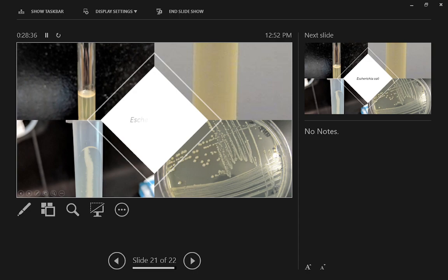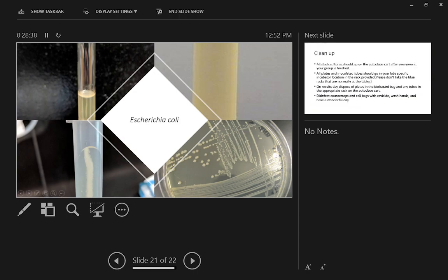The other one we'll be doing is E. coli, which we've seen before. This E. coli is special, of course, because it is E. coli that is susceptible to ampicillin. And this is the E. coli that we're going to be using for our transformation. You can see it's got a nice tan coloration. It is not serrate. It's very smooth on the ends. It also is motile, so it makes everything cloudy in a SIM or a broth. And you can see it's kind of got an undulate shape here. So not a very smooth shape, but it doesn't have the teeth like Serratia does.